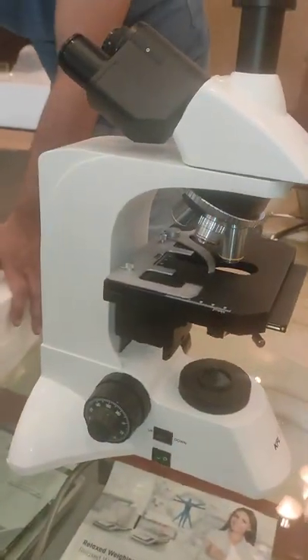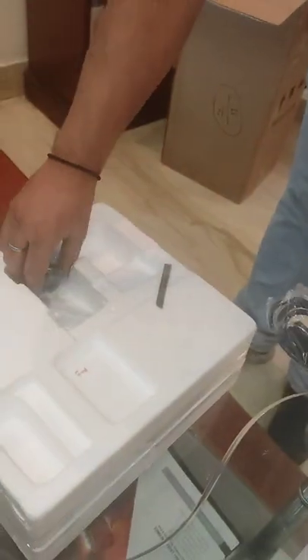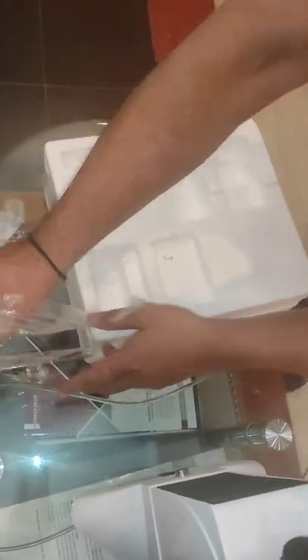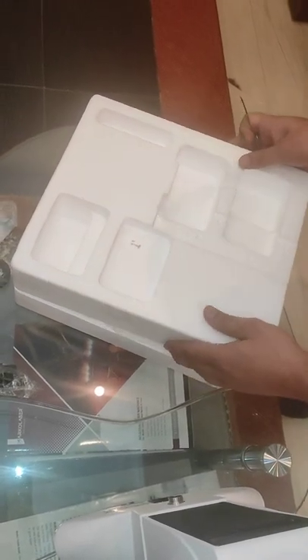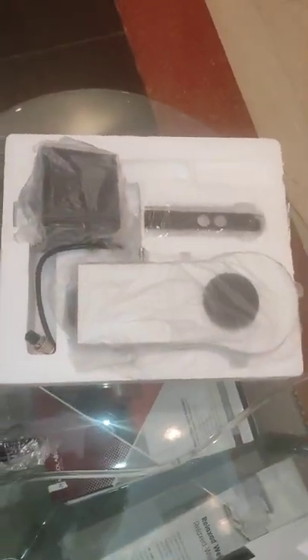Now the second box — we go to the second box. There is the power cord, camera adapter, two diamonds, fluorescence unit. There is a complete attachment of the fluorescence.